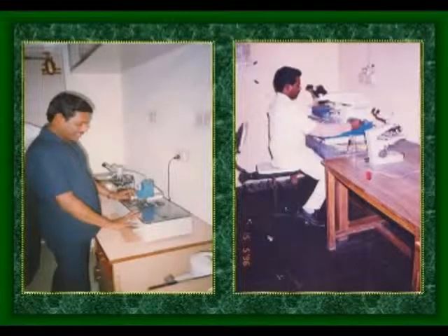After making a triangle, it should be attached with the help of plastic adhesive tabs, and the plastic adhesive tabs plus trough. Along with the trough, that knife should be attached. After attaching it, this also should be kept in the ultramicrotome. There is a provision to fix it in the knife holder.